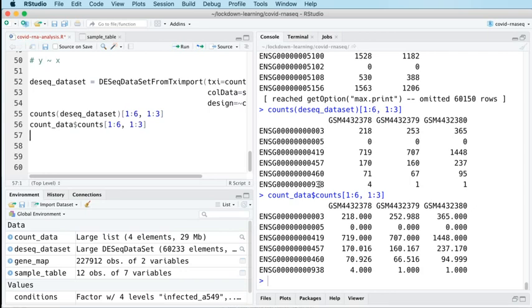And the results of tximport in an ideal world would be integer data, because when you add up all of the counts for a transcript, you should get to a whole number. But genomics is rarely that straightforward, and the existence of paralogs of genes within an organism means that quite often reads will map to more than one gene. So you will find that you don't end up with integer counts for that kind of reason, that actually the counts for some reads are shared not just between the transcripts within a gene, but actually between genes. So you don't end up with integer counts.